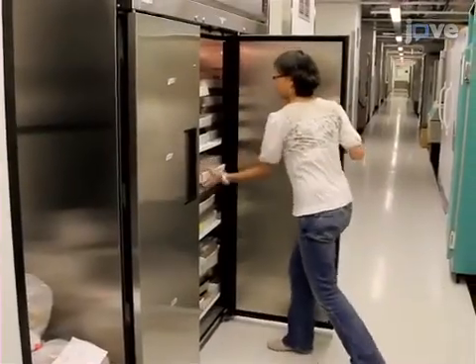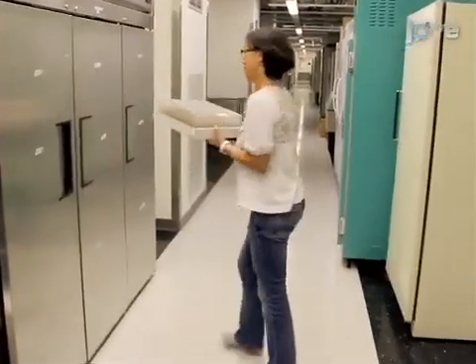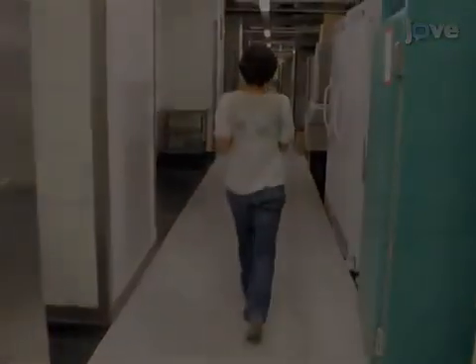Lifespan analysis requires stringent quality control of the food supply and use of healthy genetically controlled fly stocks.